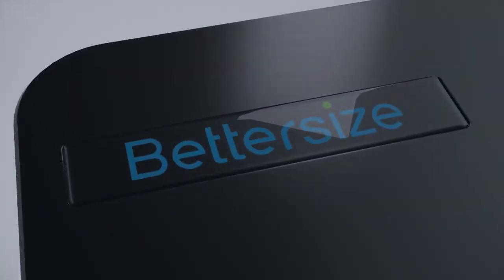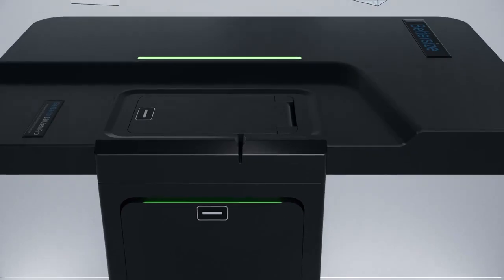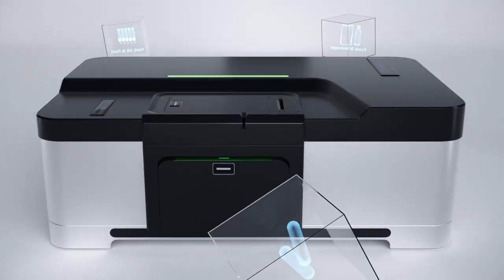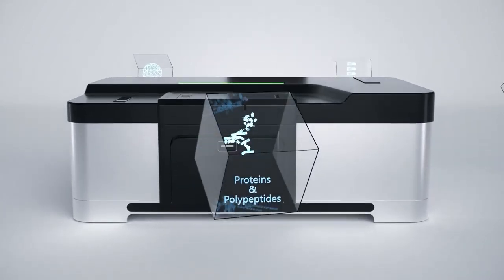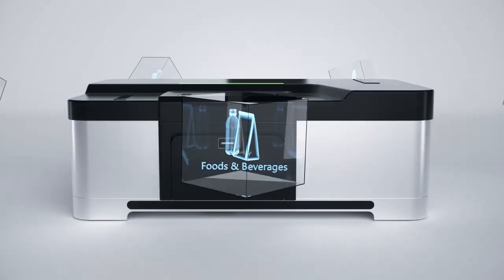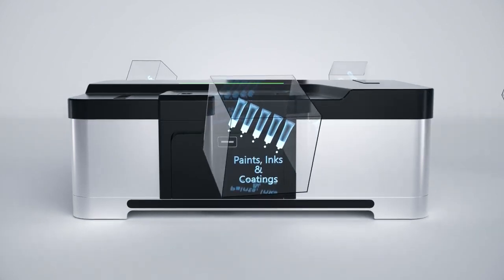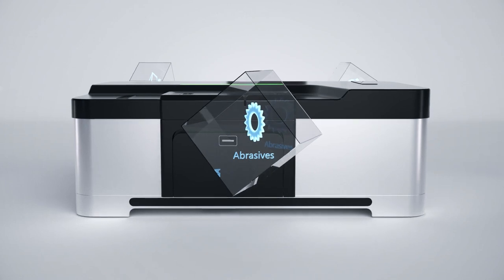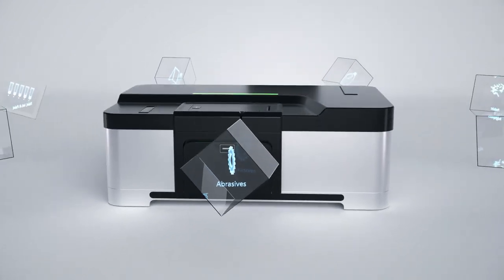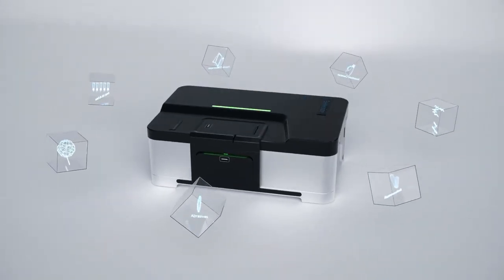BeNano, as an ideal particle size and zeta potential analyzer, has been widely used for various areas, including pharmaceuticals, proteins and polypeptides, household chemicals, food and beverages, paints, inks and coatings, nanomaterials, and abrasives. As a powerful light scattering device, BeNano helps you explore the secret of microcosm.